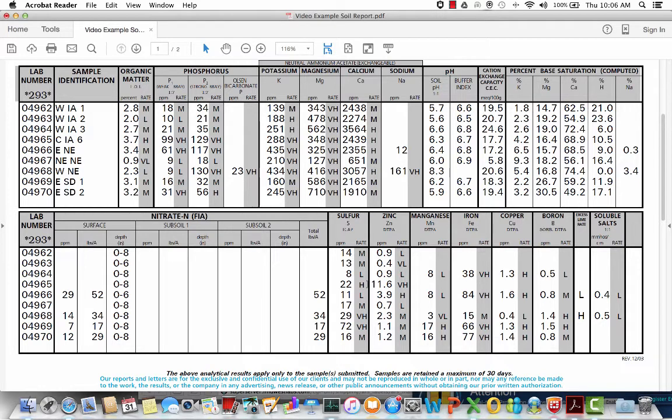But if I don't have a valid explanation for why that number's high, and I know that this is bad data, test coming back from the laboratory, correct? We check it twice, especially on this phosphorus, with the 99 parts per million on the P1 Bray and the 129 parts per million coming back from the P2. We're confident and comfortable with those values, but maybe you know that that value is probably just the case where that probe happened to pull the sample from.